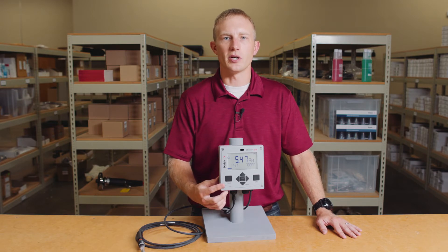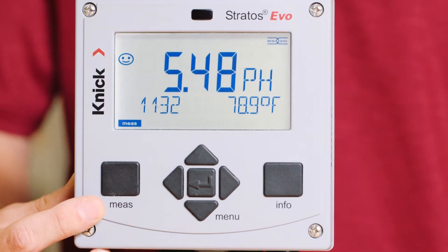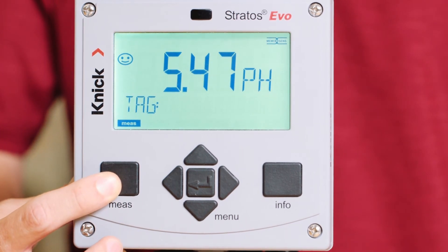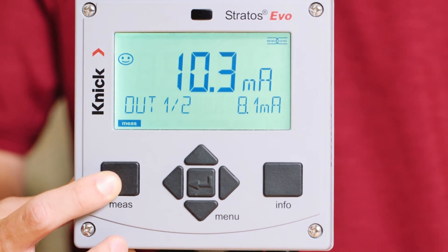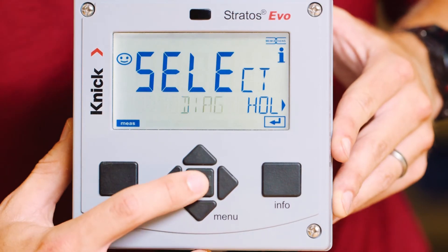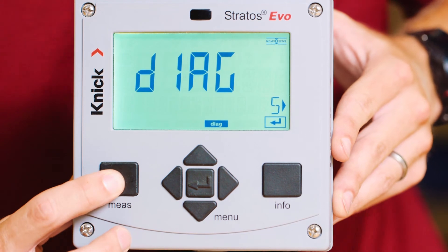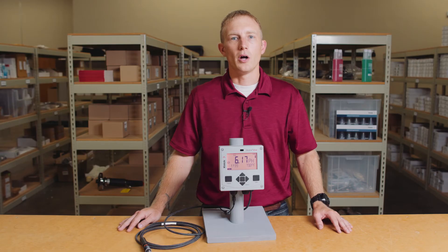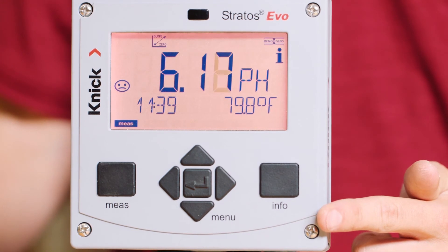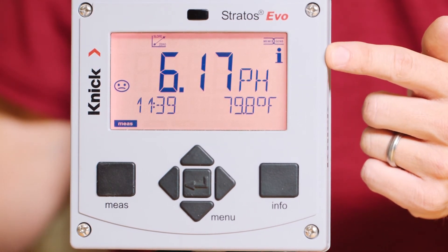Let's take a look at the buttons on the face of the transmitter. First is the measure button. You can press the measure button when on the main screen to toggle through the different displays. When you dive into different settings on the transmitter, the measure button also acts as the back button. On the right hand side of the transmitter is the info button. Use this button when you see the eye on the main screen, indicating that there's additional information.